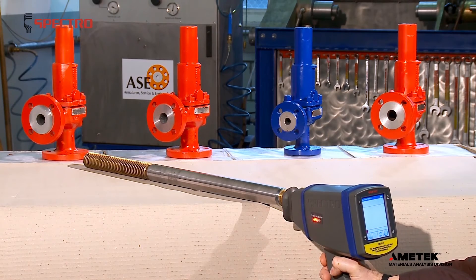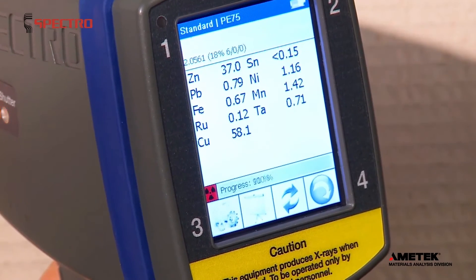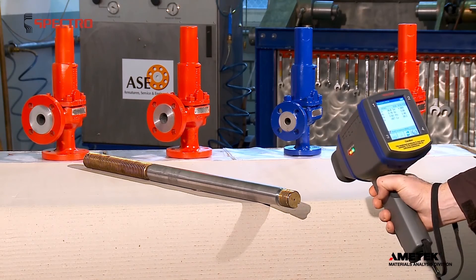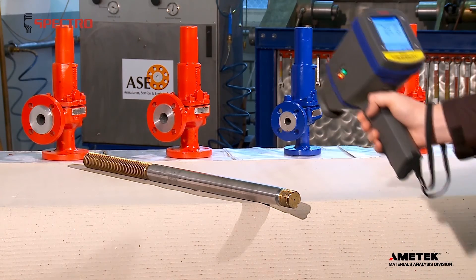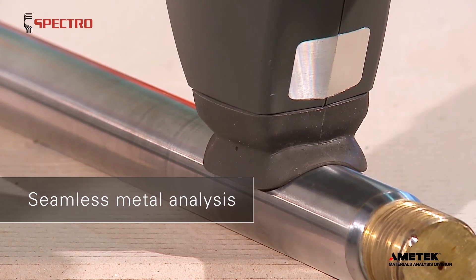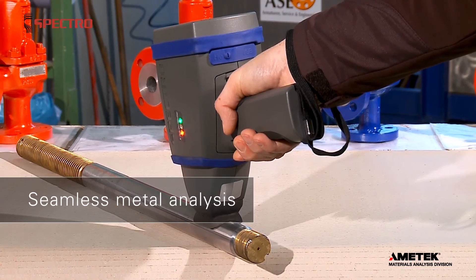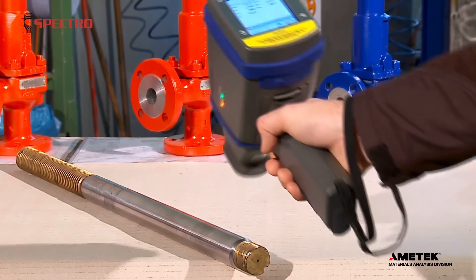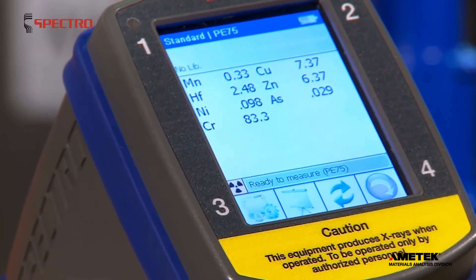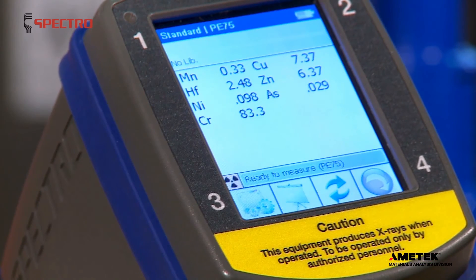Or take a coated material, such as this rod. You may be interested in identifying and analyzing the base material. But then Exsort lets you identify the coating material just as quickly and easily. Here, for example, you can determine whether it's nickel-plated or chrome-plated. With Spectro Exsort, you can move seamlessly from one type of metal analysis to the next.